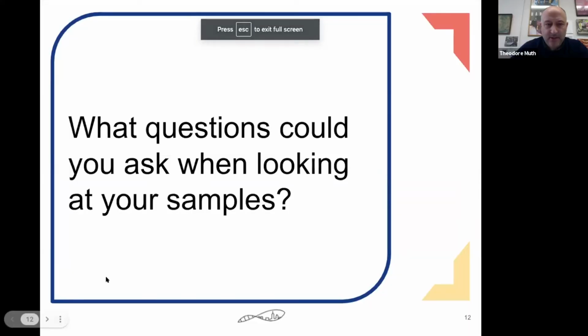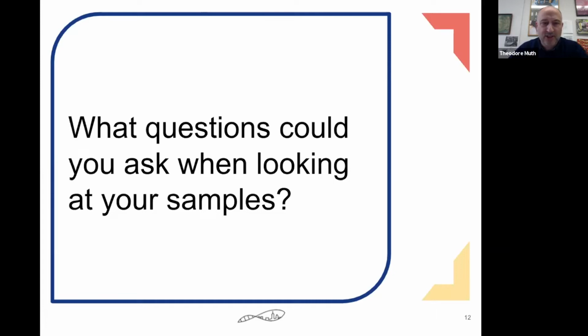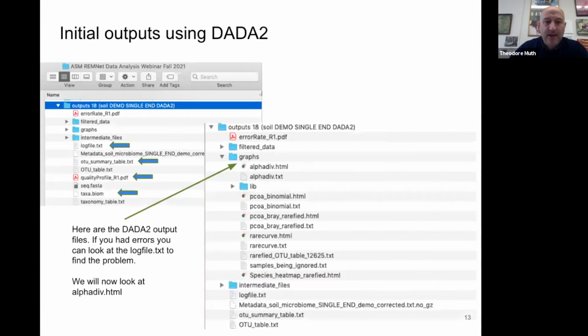Okay, so lots of interesting things coming up on the Jamboard. I think we'll curate that and share it afterwards. So the next file that makes sense to look at after rarefaction is the alpha diversity file, because that's what we were just looking at when we were talking about what we can detect when we were going through the park.